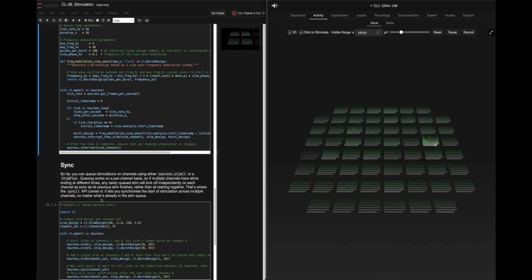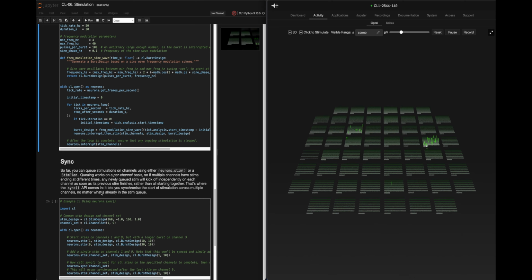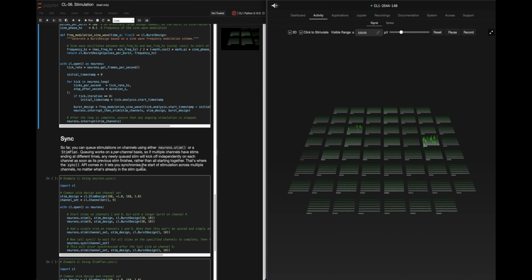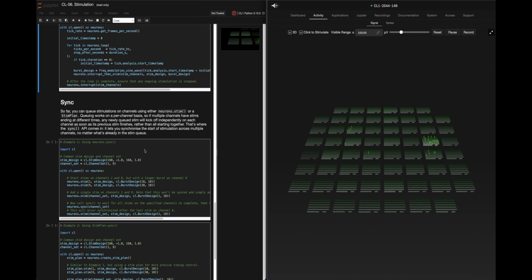But also, let's say there's an action and the little guy in Doom is shooting a monster. You could also use it there: if he's not shooting the monster right, stop what that's doing and start a stimulation pattern that's predictable. So interrupt the one that's chaotic, start one that's predictable. Again, that's the free energy principle, a good way to implement it on the fly. When you're doing online learning, kind of on-the-fly test time training style, this is really important because it helps you actually control those processes.